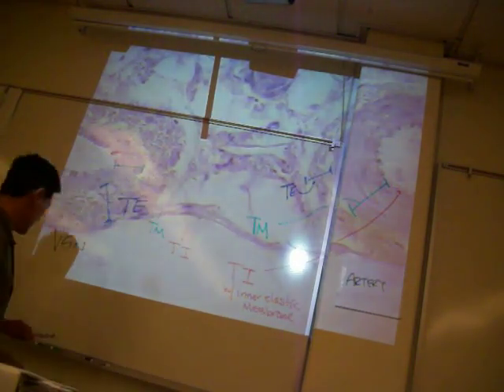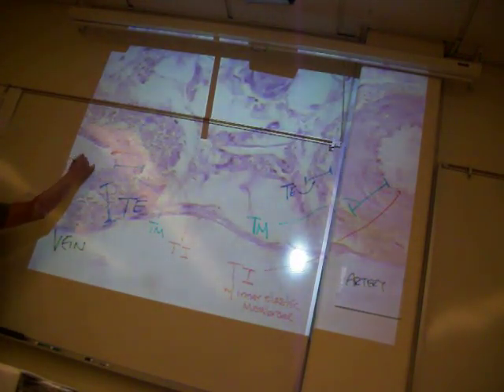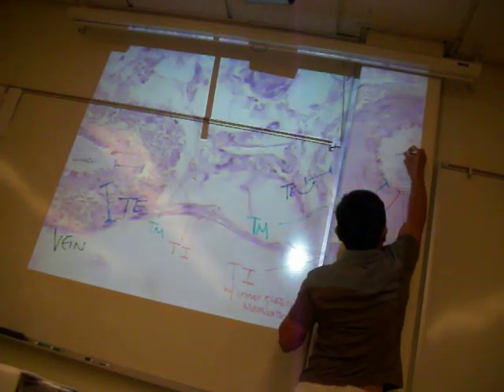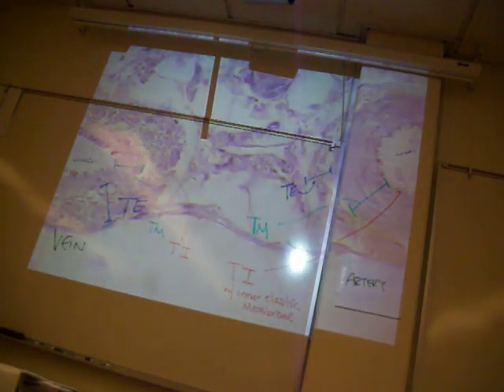That'll wake you up. All right. And then right here, this will be the lumen. There's the lumen right there. Okay. All right. Not the best view, but is that focused?